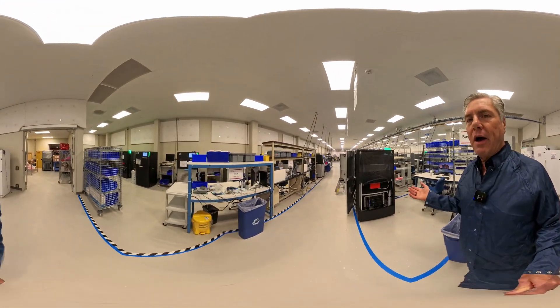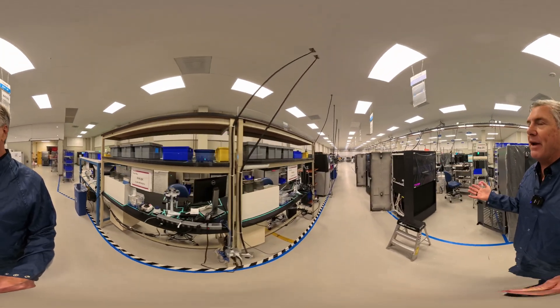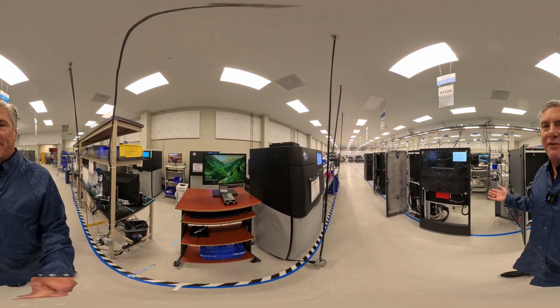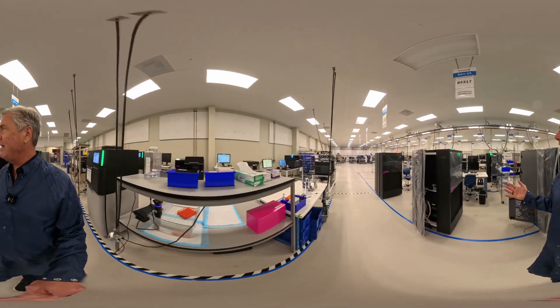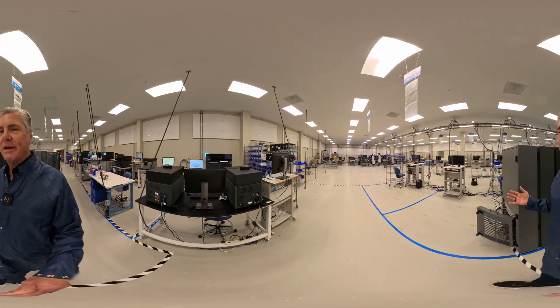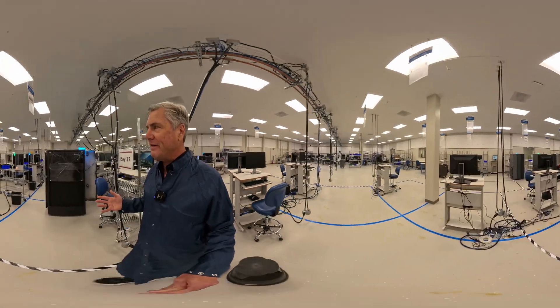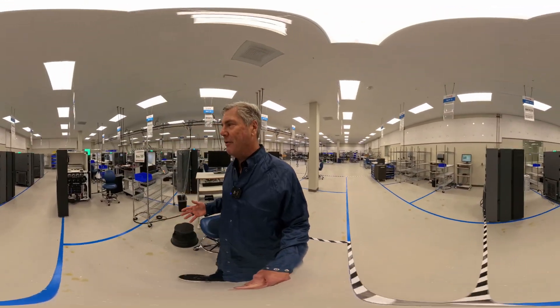We manufacture both the Revio and Onso instruments here. You can see a number of Revios in the final stages of production. We're actually at the end of our manufacturing run for the quarter, so almost all of the manufacturing is already done and the floor is a little quieter than normal. But you can see these last few Revios being put through their final paces. If we come over here we can take a look at one of the Revio systems as it's being manufactured and see what really creates all this incredible sequencing.